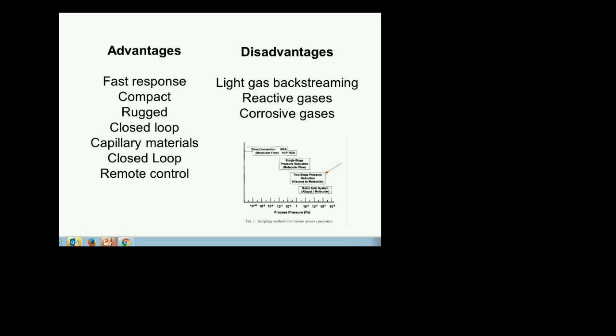You do a background scan in your chamber, like you said. You make sure there are no hydrocarbons, or you figure out how much hydrocarbon there is. Then when you run your parts, you add the signal from all the peaks above 45 AMU, and that's what they call the total organic content.